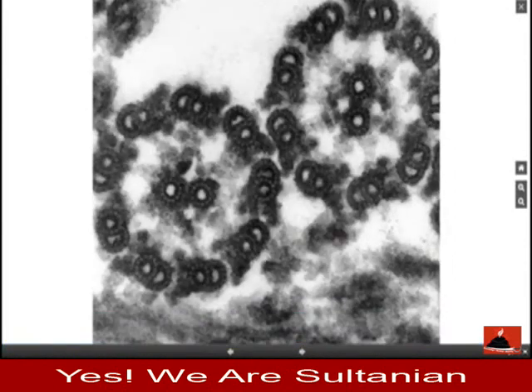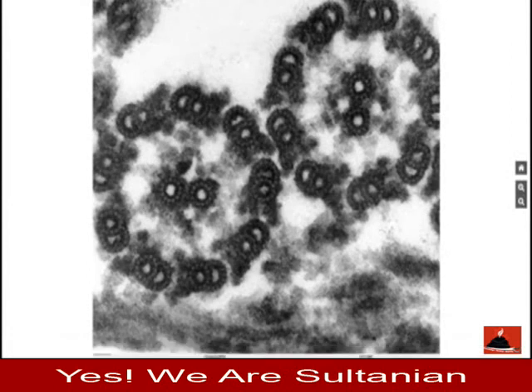The other one is a transmission electron microscope, and that's more like the light microscope in terms of the fact that here we have electrons going through the specimen. In areas that are thicker or more dense, the electrons are not going to get all the way through, whereas in the thinner areas, or where it's just water, where it's less dense, you can have more electrons passing through the sample. So it's essentially sampling density, or what's retarding those electrons from getting through the specimen. This is like light microscopy, and what you really get here is more of a 2D image, almost like a slice through the specimen.